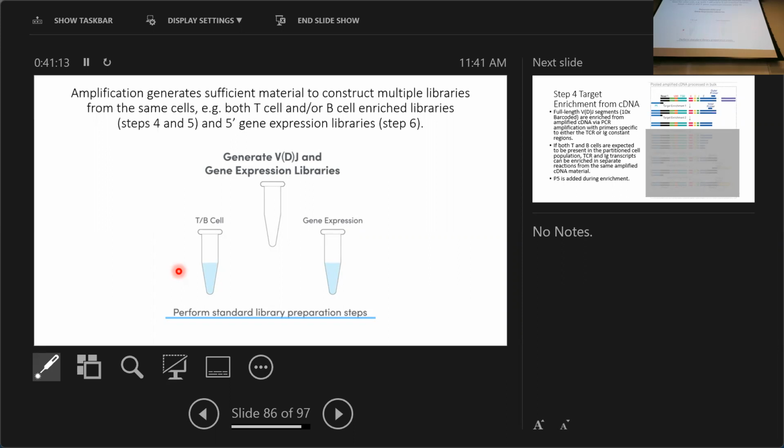It will get amplified here. But this gene could be the T cell receptor gene. The specific primer will get the sequence for this. And also, you know this receptor is from the same cell. So later you will know, for this green cell, its receptor expression. And also you know its mRNA expression because you have the same label here and you separated them. The green one still here, green one here.